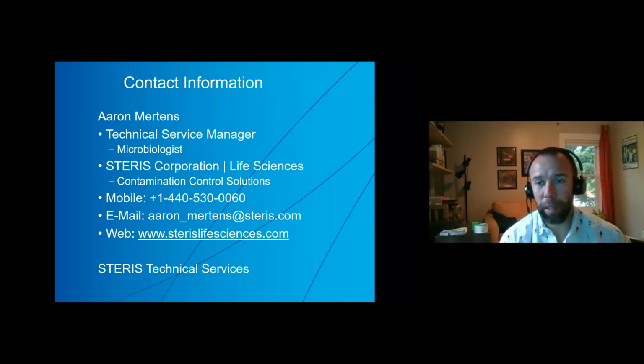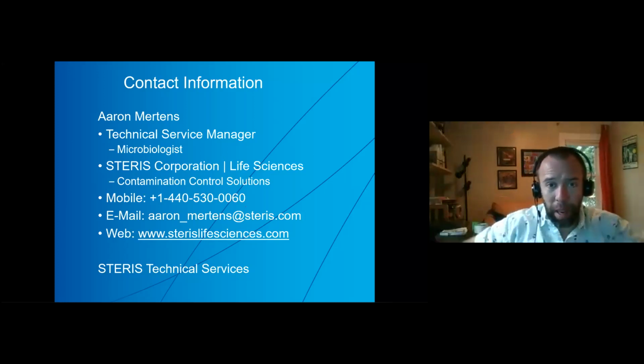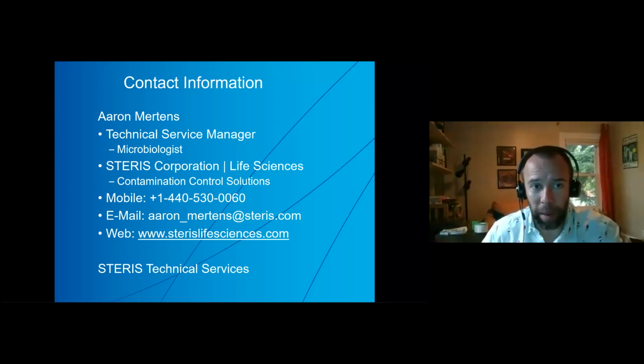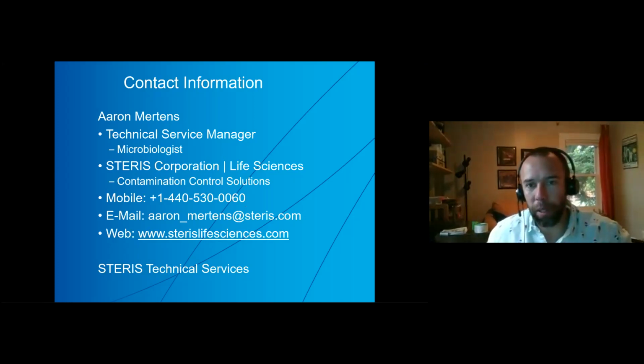However, if you have a very large autoclave, maybe a walk-in style, then I would even increase that to more than 20. But with your normal autoclave where you're pushing in a cart, typically you've done some cycle development work and you've found the worst case locations. So I think if you're using 12 as a minimum, that's acceptable.